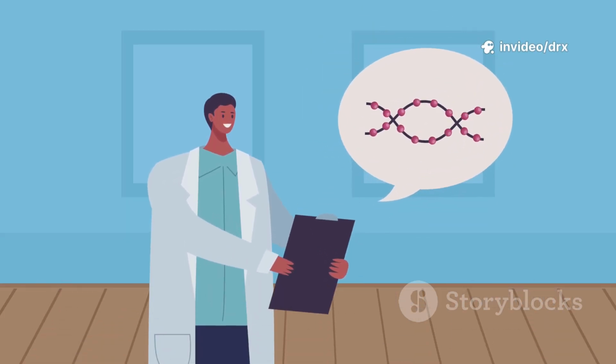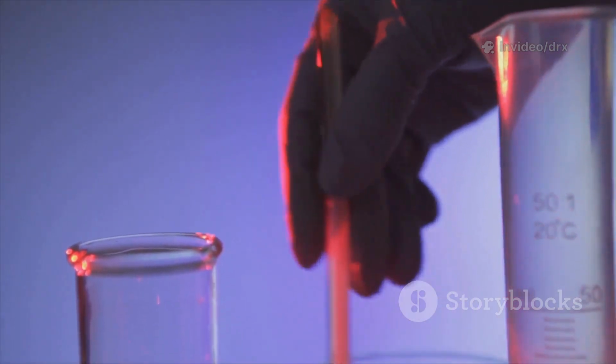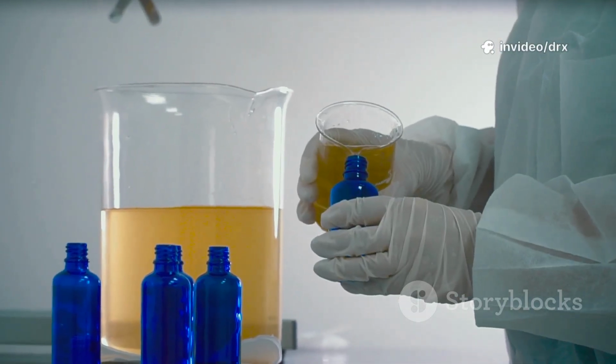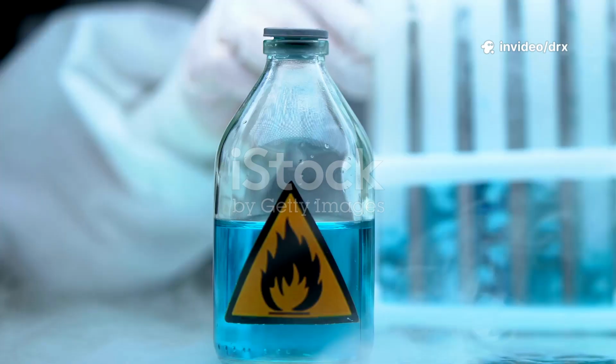So, let's talk about the advantages. Non-aqueous titration is really accurate for weak acids and bases. It gives sharp endpoints, which is super helpful. It's also suitable for water-insoluble drugs. And yeah, there's no interference from water reactions.